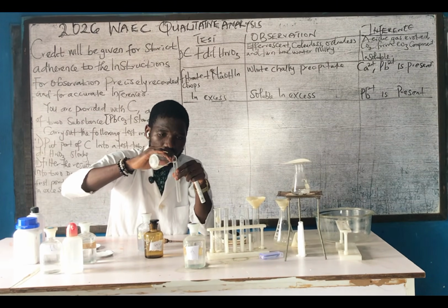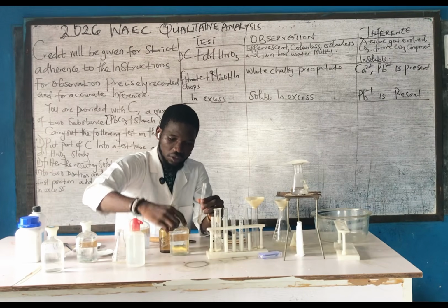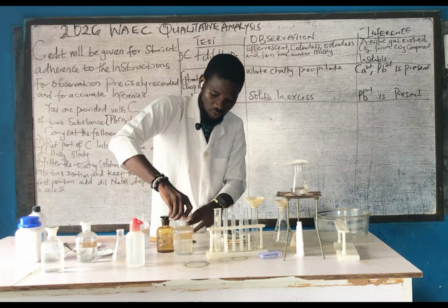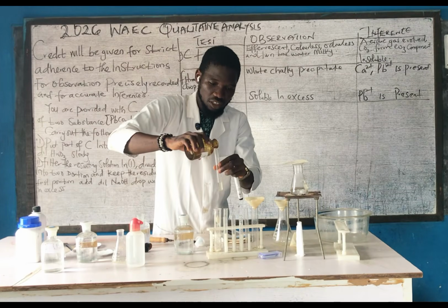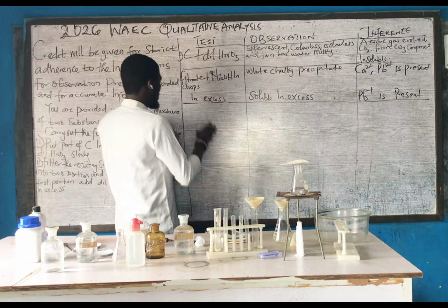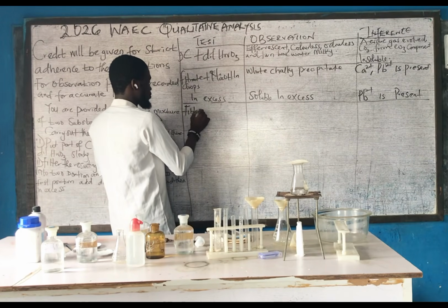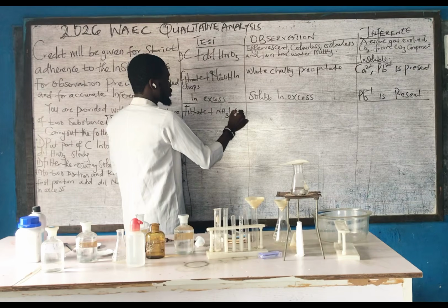So, and ammonia. Let's see what we are going to have. For the ammonia, I have it in drops. So they said filtrate plus ammonia in drops.